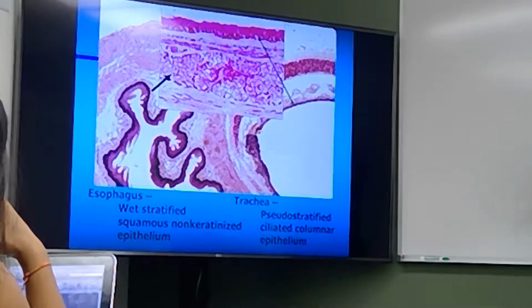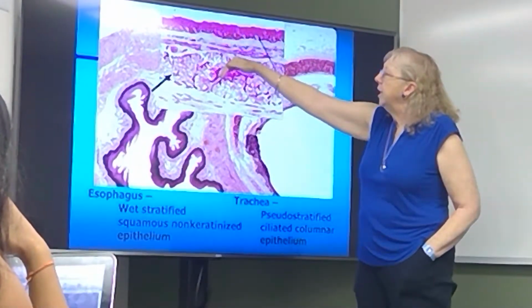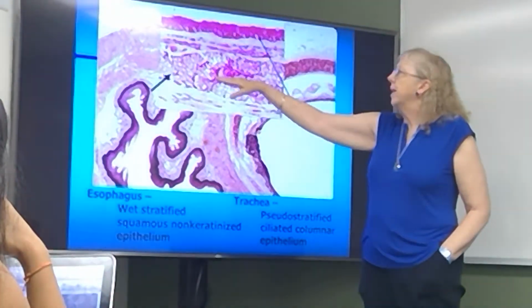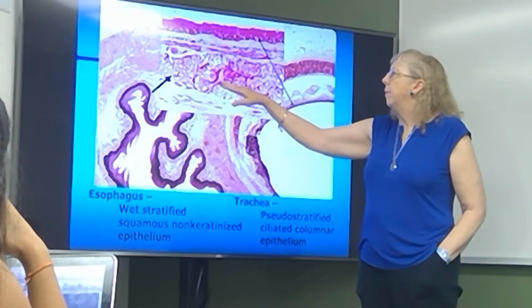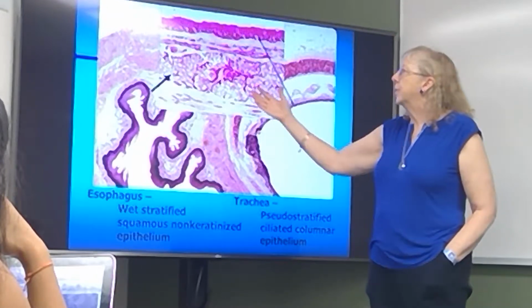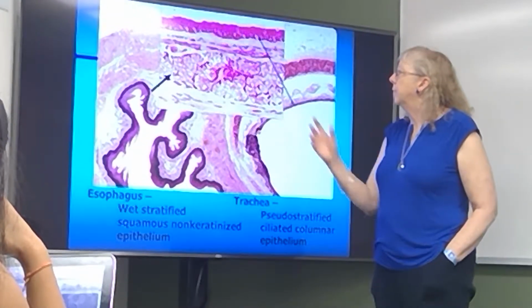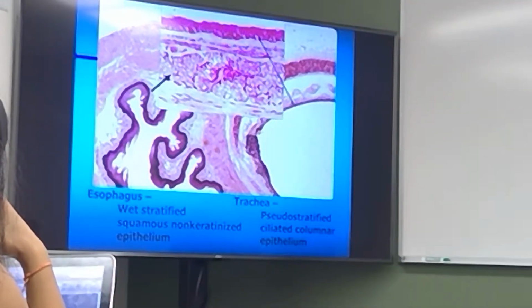And here's an example of our glands. Invaginated, so they've been pressed into the connective tissue, and then the epithelia lining those glands has become modified into cell types that produce various secretions, such as mucus, as you can see here, or in other cases, more watery secretions.